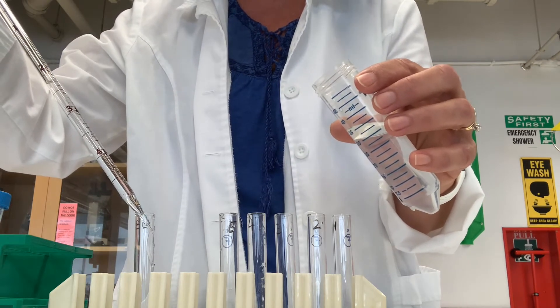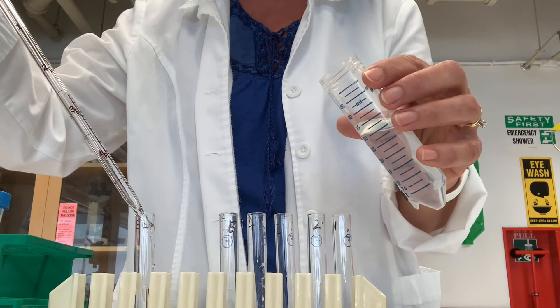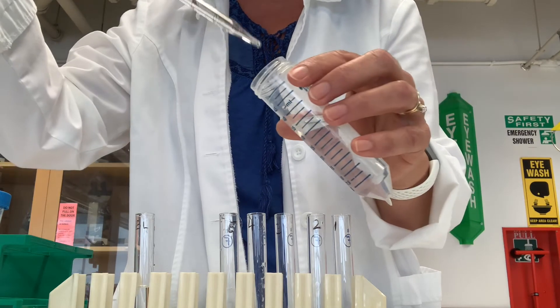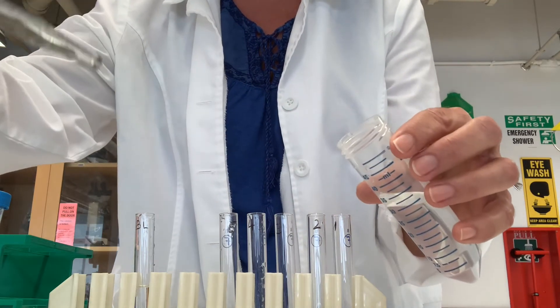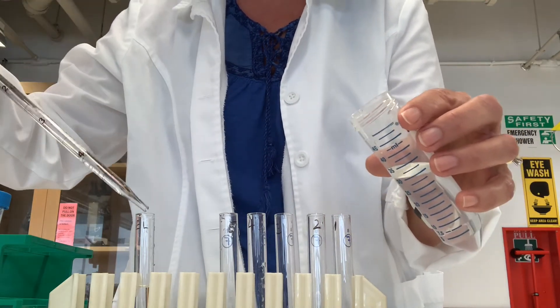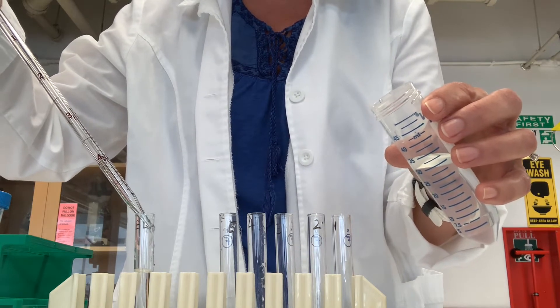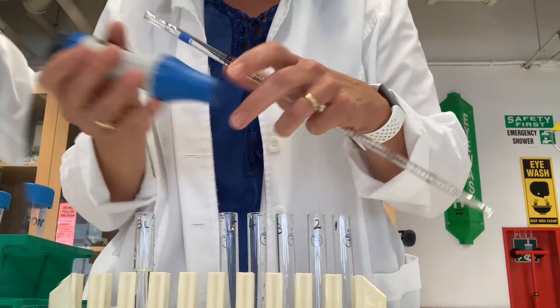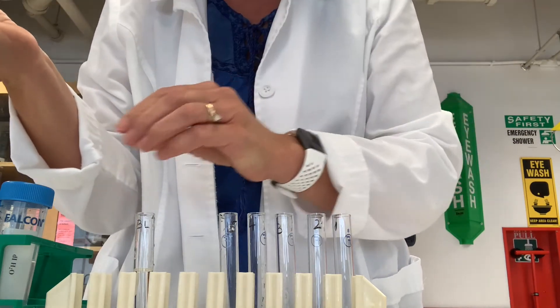I filled the pipette to zero for the first five milliliters. I then fill the pipette to the four mark, which is one additional milliliter, and add that in to make six. Now we're going to switch pipettes and start making our serial dilution.